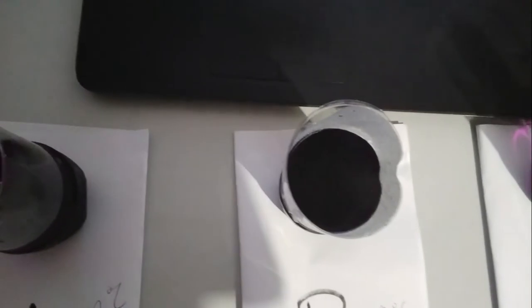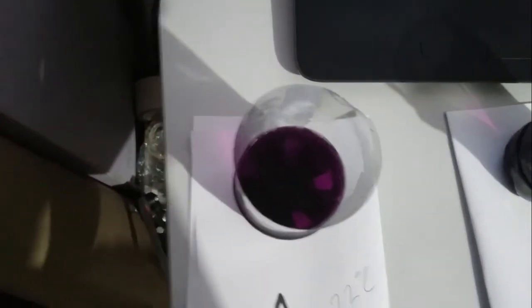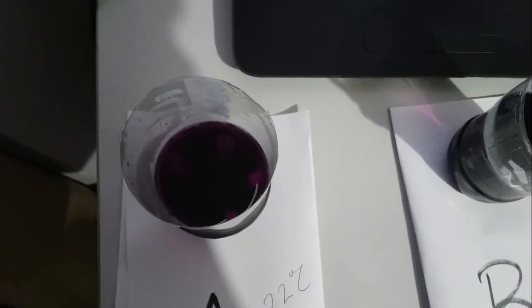So I'm sure based on what you're seeing, you could make a decision. I think you could clearly say how temperature impacts the rate of diffusion. Now, this is very, very important, because if you're going to be applying any pesticide, aerosol, then it pretty much dictates how fast it will move on a hot day versus how fast it will move on a cold day. All right, so this experiment is really, really important.